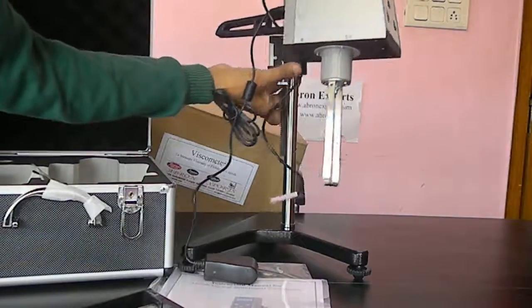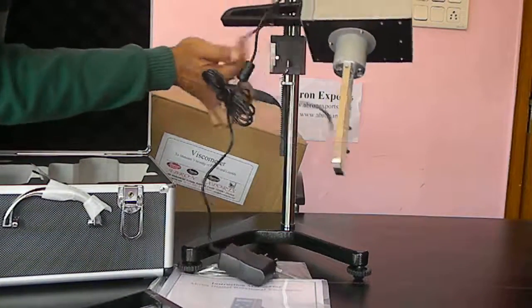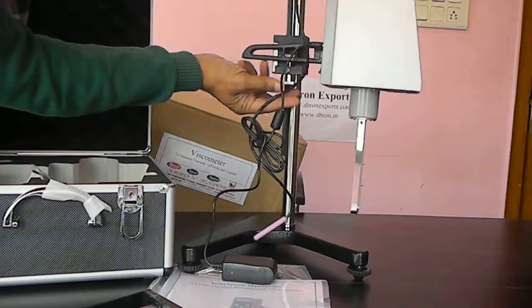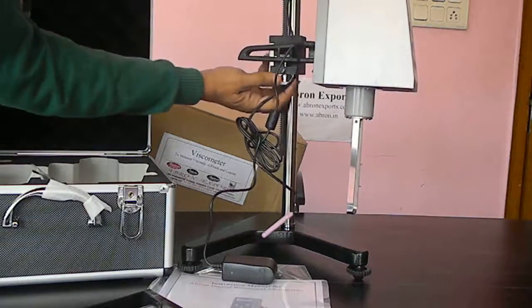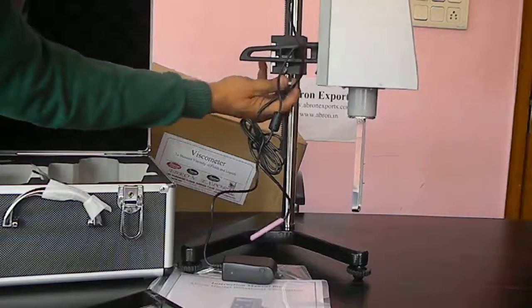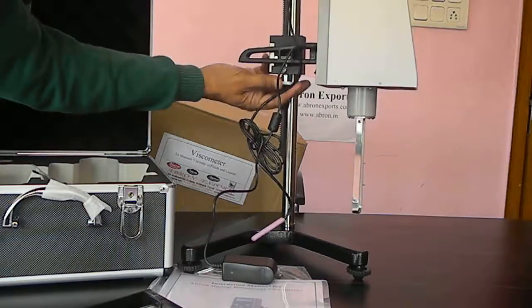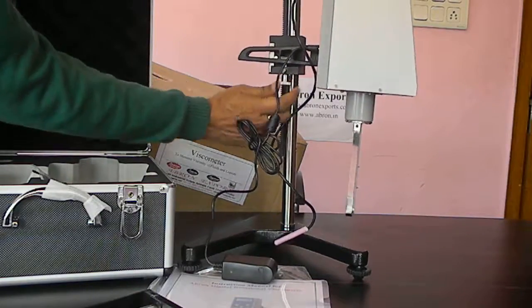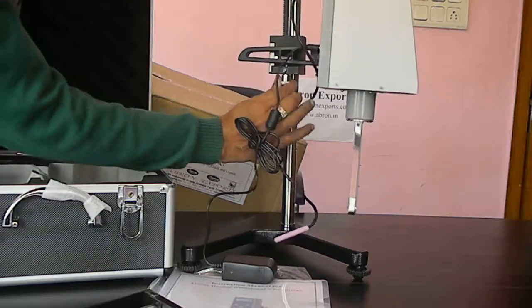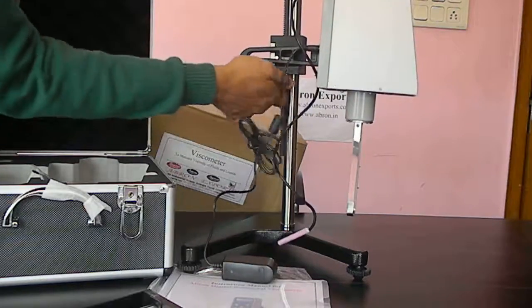Then we have to, there is one hole here and screw. We fix this screw. While this rotating we can fix this screw to the base, so that viscometer is fitted to the stand.